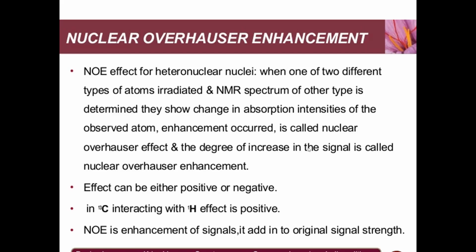What is the mechanism observed in this method? The dipole-dipole relaxation between two spin-active nuclei. So the spatially adjacent neighboring nuclei undergo a cross relaxation of spin polarization.